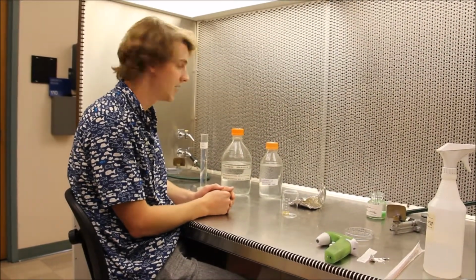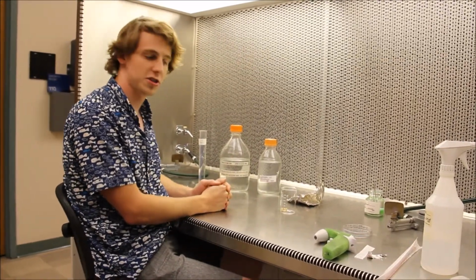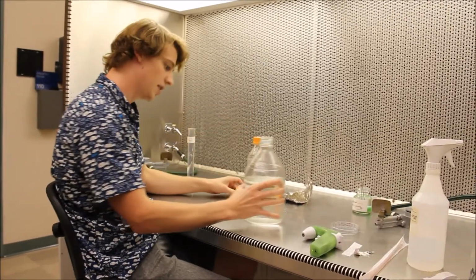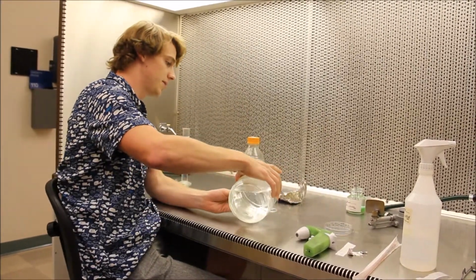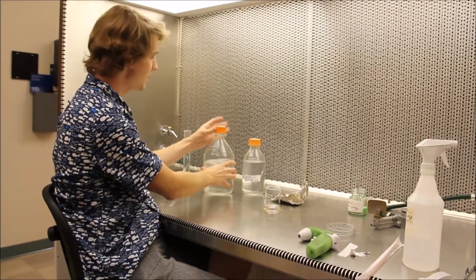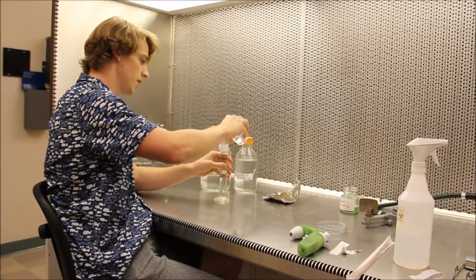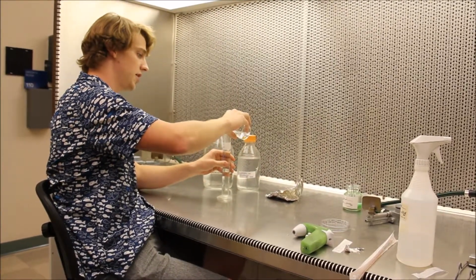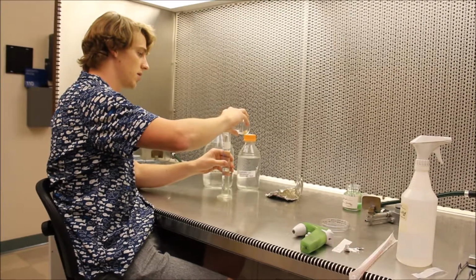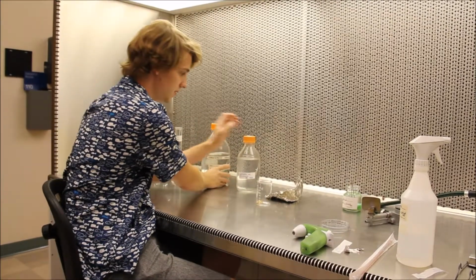Welcome back, everybody. So after you soak your seeds in bleach for 5 minutes, you're ready to wash them with water to dilute the bleach out of the seeds. For this we use sterile DI water. You wait around a minute and you pour the water off, slowly decanting, making sure not to lose any seeds. And at this point they should be sterile.